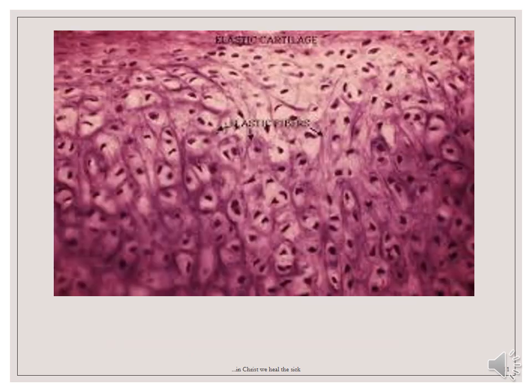This is also another slide of the elastic cartilage. We can see the numerous chondrocytes and then the network of fibers appearing in black across the matrix between the chondrocytes. As you can see here, you can see the dark appearance of fibers across this matrix.